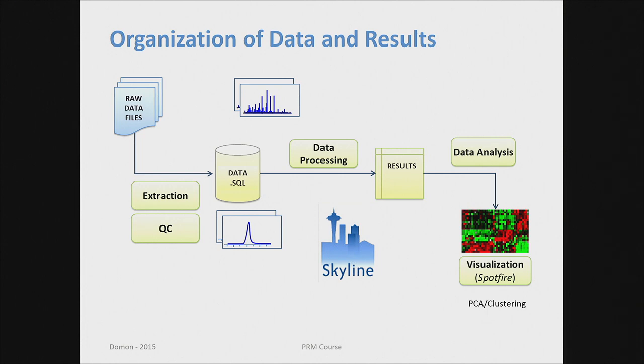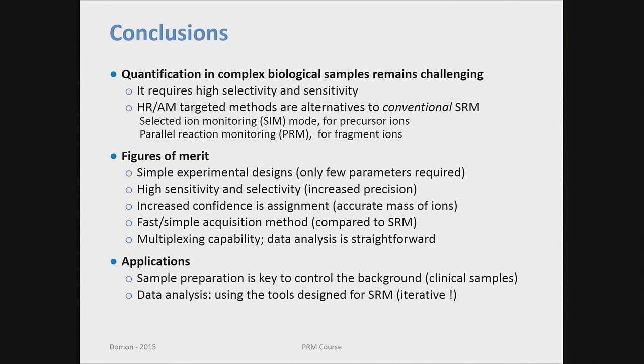You could further analyze clustering as everybody is used to doing, using different tools for statistical analysis or clustering, depending on what your application is. But basically you can very quickly and easily generate your result.